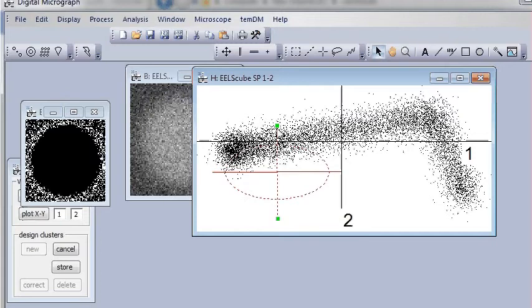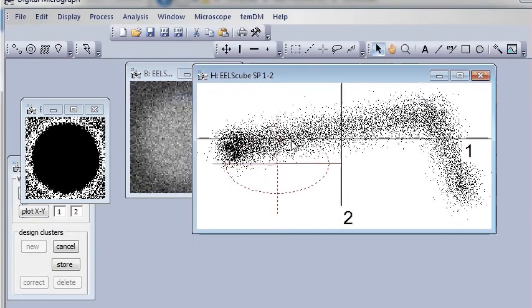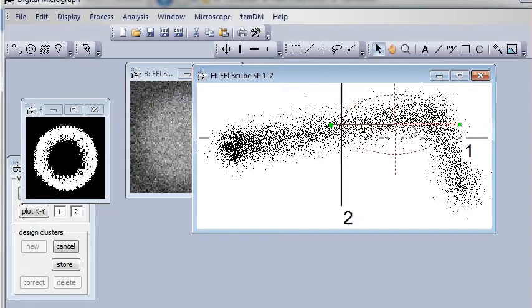There is also a line along the minor axis, and by dragging it you can change the proportions of the oval. You probably notice that there is a binary image which shows you live the pixels currently included in your oval. That gives you a good idea about the connection between the energy space and the real space.